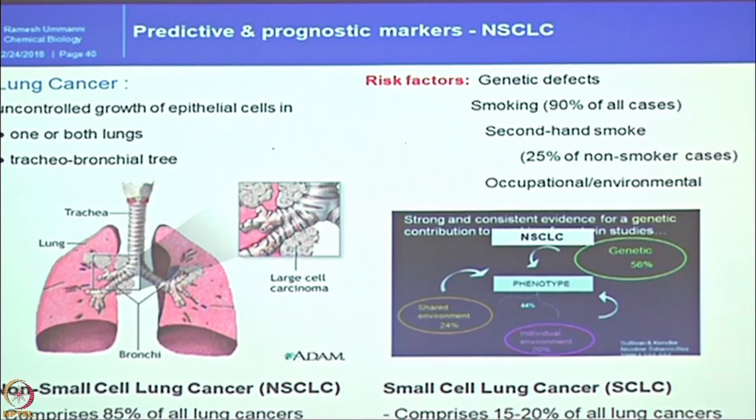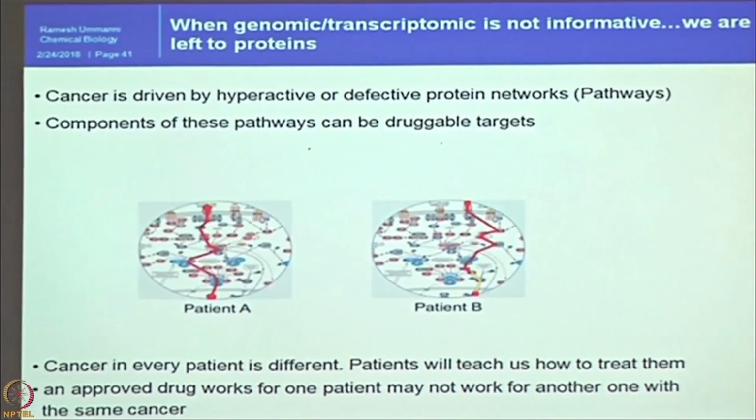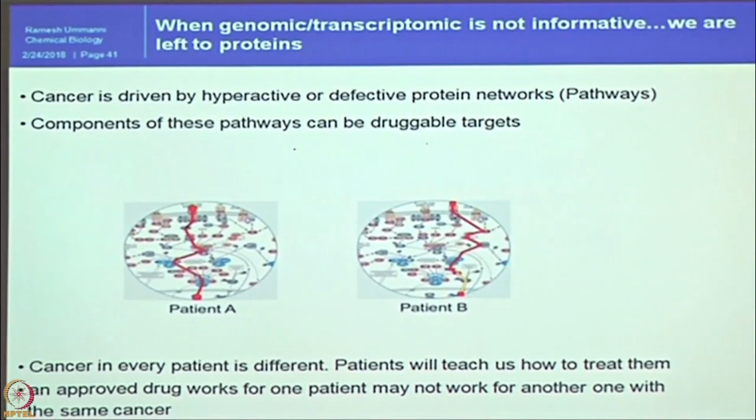Now in the clinic, even doctors are not able to segregate them before starting the treatment. So what kind of drug is good to give to them? Keeping that in mind, we tried to do a good experiment on how we can separate the patients based on their molecular subtypes using the RPPA approach. I will show only one or two examples of why it is required.